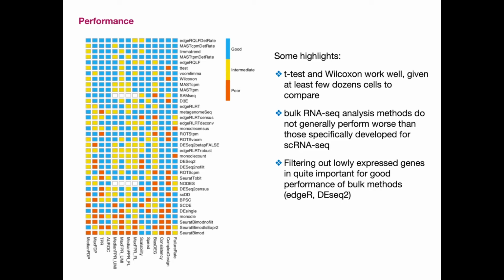Because that's also something that's important to think about. For instance, now in the exercise, we integrated 6 samples. And then we want to do differential expression between cluster 1 and 2. We want to make sure that the differential expression is not driven by batch effects. So then you can add in factors, like for instance, the batch information, into some of these tests, but not all of them. So Wilcoxon is the default in Scanpy, but maybe not the best when you also want to control for batches.